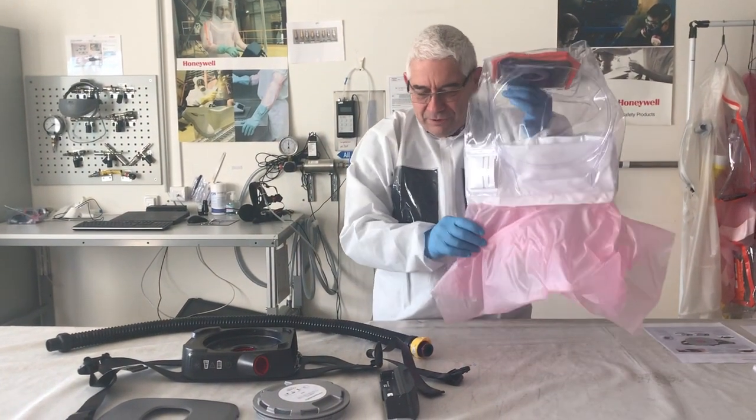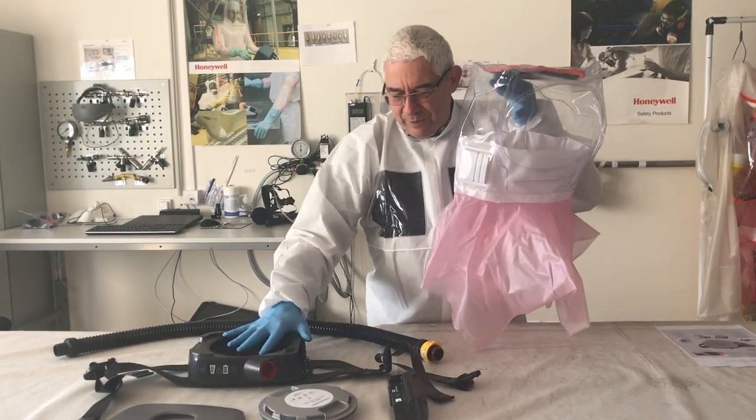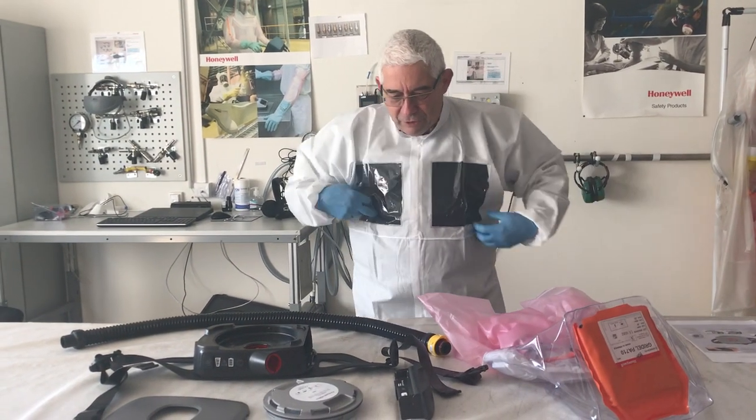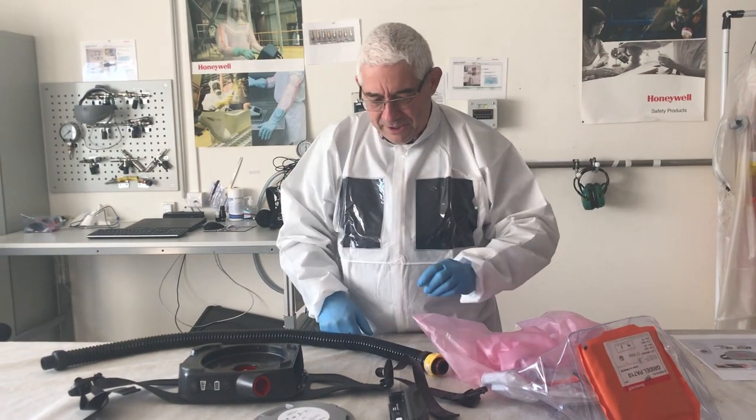A video to explain how to use this Gridel hood equipped with the PA700 blower. You'll be working with the DeltaSafe, which is a breathable material.